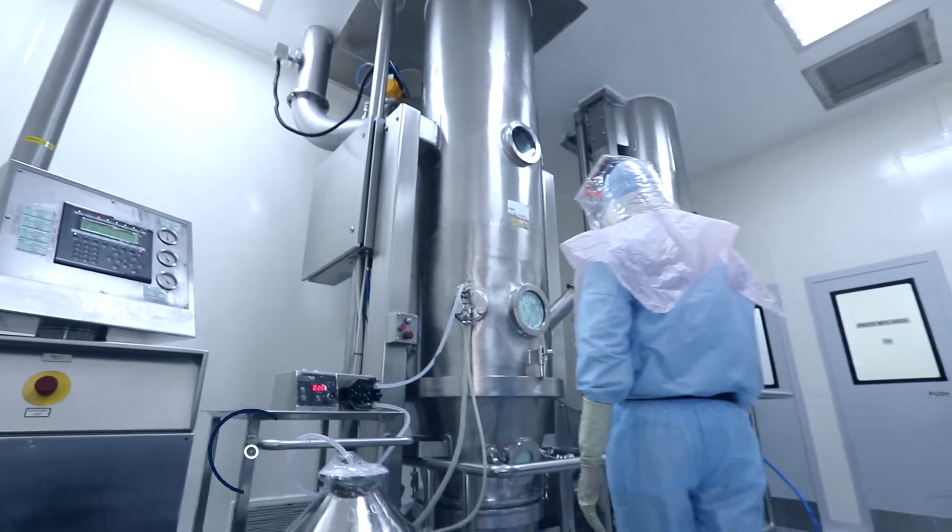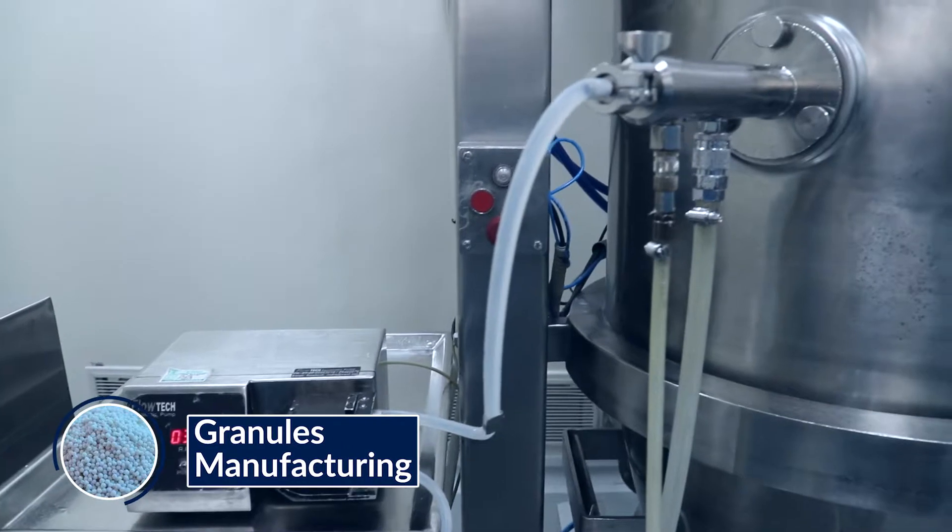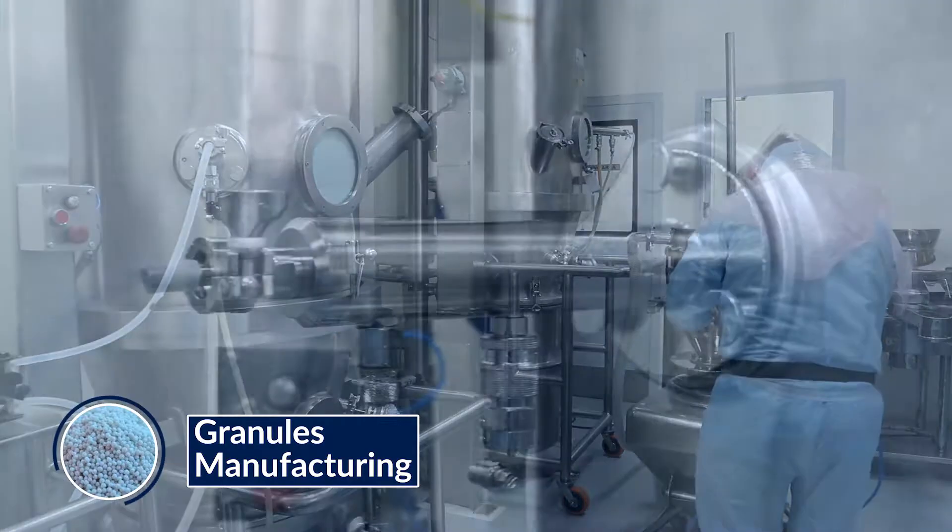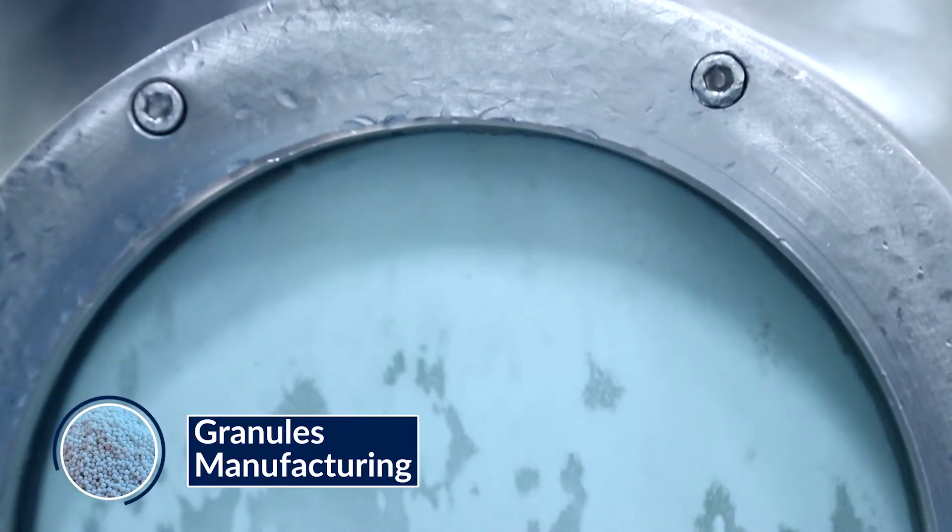Granules manufacturing. The raw material is then blended as per the validated process parameters and pharmacopoeia. The granules are then fluidized and coated with hot air blowers and binders.